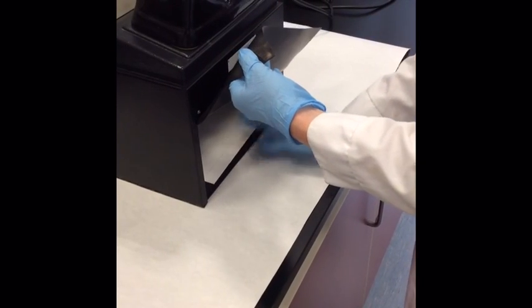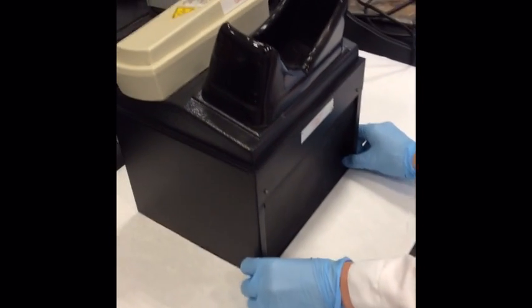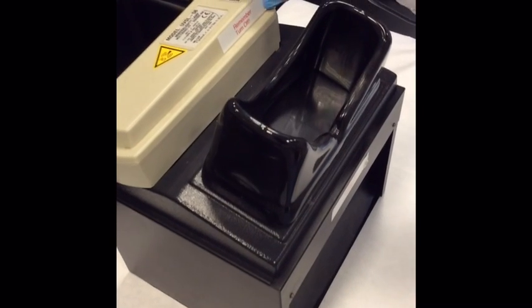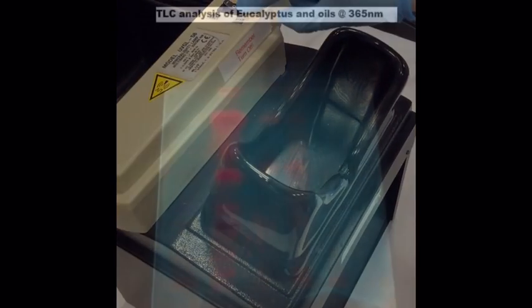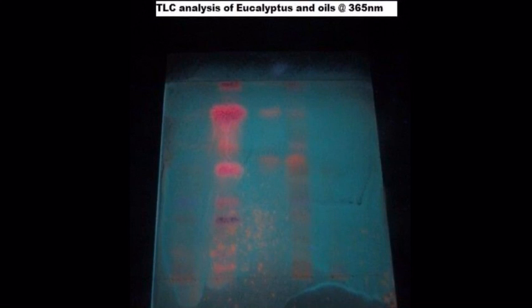When visualizing the plate in the UV chamber, make sure you use a pencil and circle the bands, as the bands will not be visible in normal light. You can use the camera in the lab to photograph the plate under UV light inside the UV chamber.